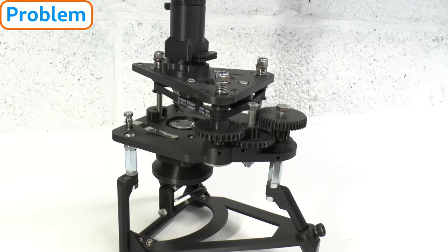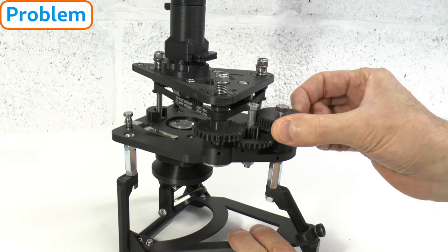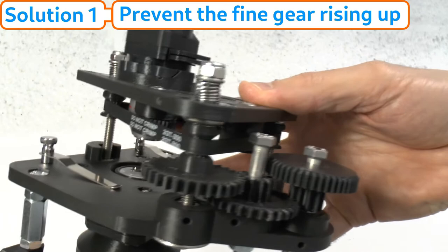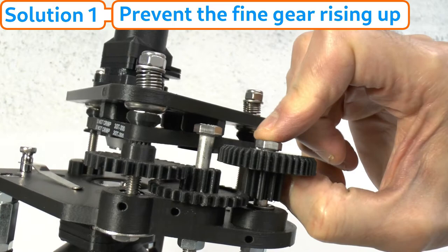We now move on to the separate issue of sticky focus gears. This means a lot of force is required to adjust focus, even with the fine focus gear — the coarse gear is usually a bit hard to move anyway, which is why Puma uses a three-gear system. It may also manifest as excessive elastic backlash. Sticky focus gears can sometimes happen if the fine focus gear is allowed to rise up its M6 axle bolt, because the bolt shaft fans out near the bolt head, effectively increasing its diameter and causing it to catch on the axle hole of the gear due to friction.